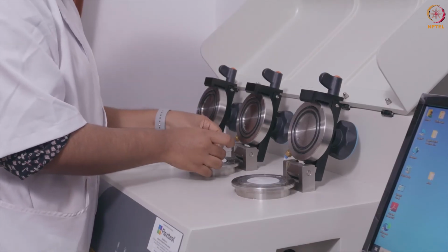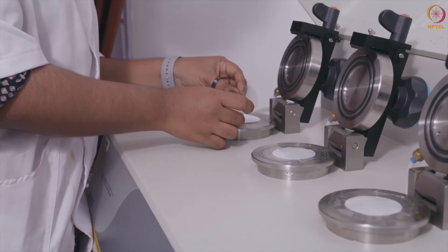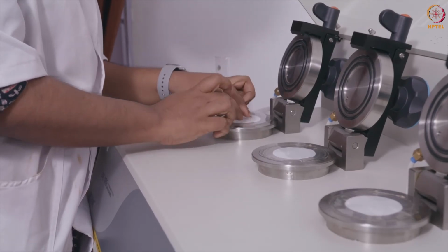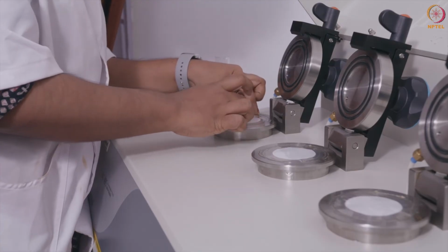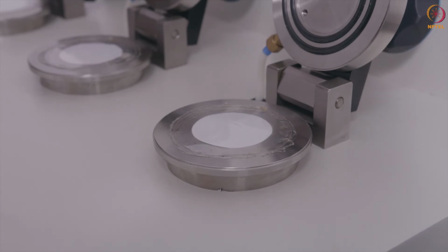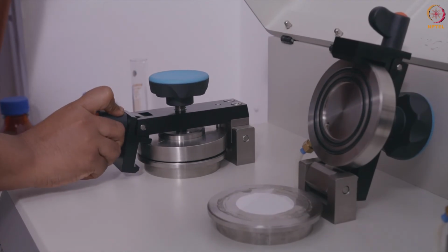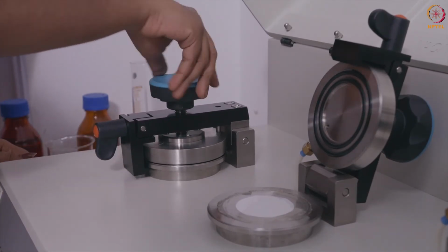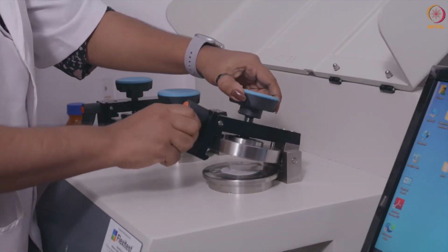The lower pressure chamber is first evacuated, followed by evacuation of the entire cell. A flow of gas or oxygen is introduced into the evacuated higher pressure chamber and a constant pressure difference is generated between the two chambers. The gas permeates through the test sample from the higher pressure side into the lower pressure side.